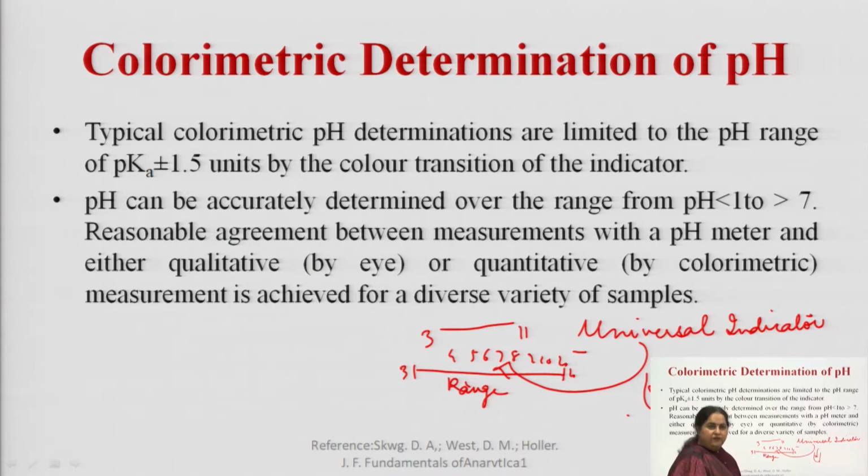What we'll do further is we will prepare test solutions of different pH from a range of 4 to 6 within a gap of 0.2 units.